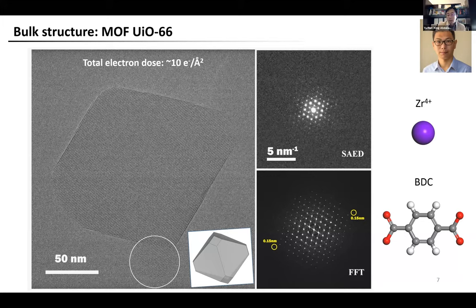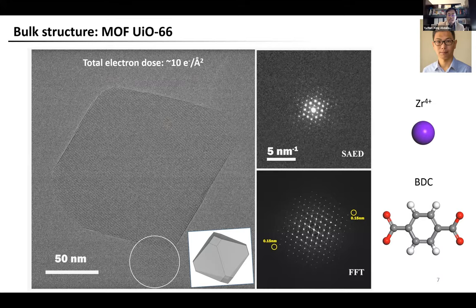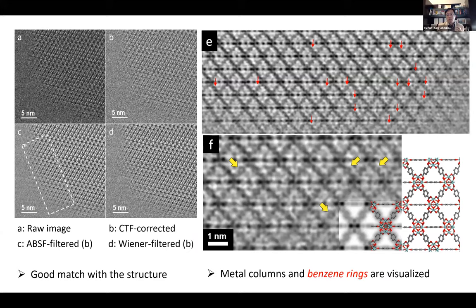This is an HRTEM image of UiO-66 acquired with a total electron dose of about 10 electrons per square angstrom, and the image resolution is about 1.5 angstrom. The processed image shows a perfect match with the 1,1,0 projected structure model of UiO-66. All the important structural features in this projection — including triangular channels, inverted triangular channels, zirconium clusters, and the organic BDC linkers — can be clearly identified in the image.